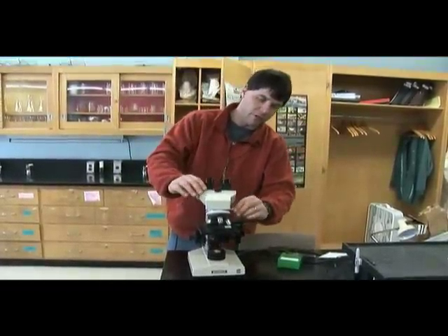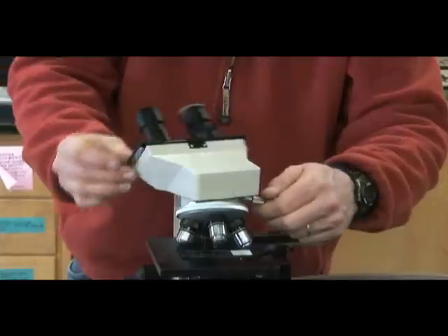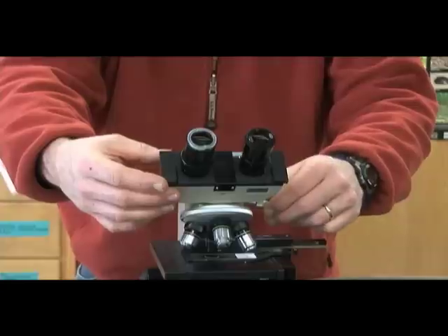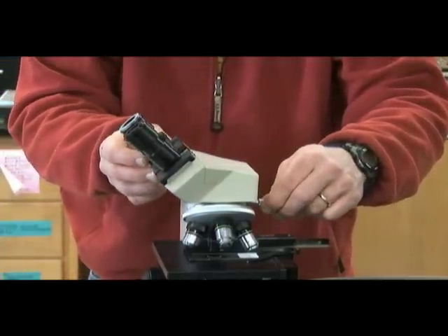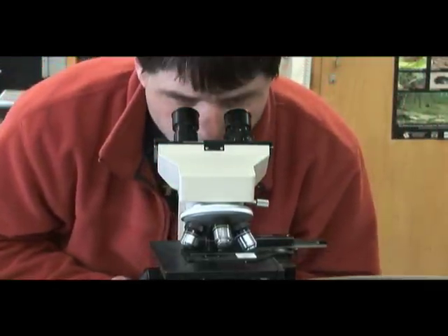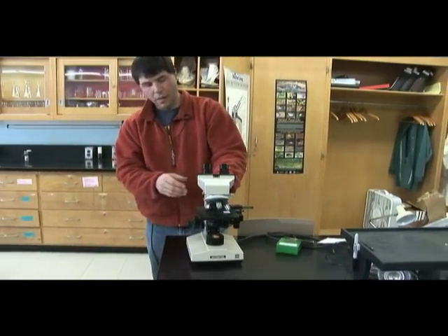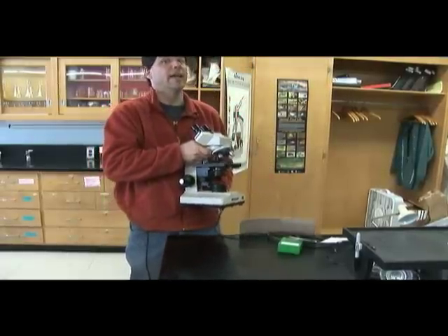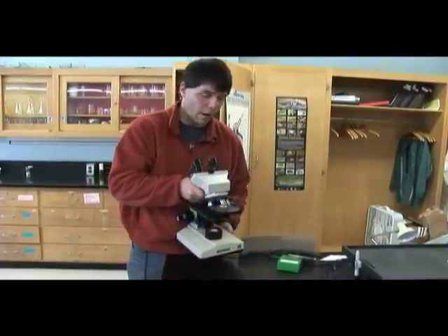A few other features of this scope: we can loosen this thumb screw here to allow the ocular lenses to swing around so that you can use this scope at various angles and attitudes. Show your instructor, for instance, what you're doing, and then move back to be comfortable at your own angle. A few other things you need to know about the scope. Whenever you carry a scope, it needs to be two hands. This is an expensive instrument and needs to be cared for properly.